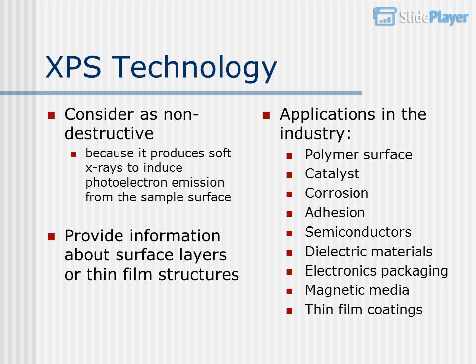XPS technology is considered non-destructive because it produces soft X-rays to induce photoelectron emission from the sample surface. It provides information about surface layers or thin film structures.